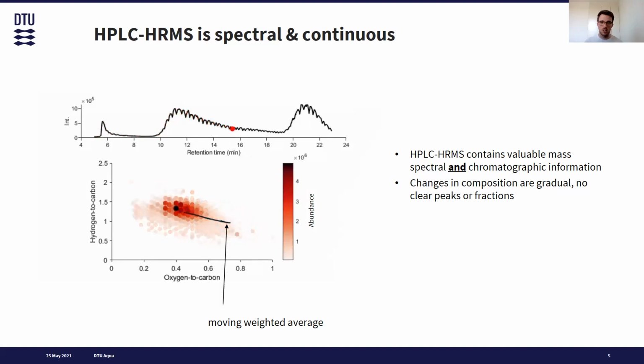So it isn't the case that we have clear-cut fractions that differ completely between the different fractions. We have a lot of things in common and some changes in the composition, but they are very gradual. So this is a relatively complex separation that is very gradual. So a fractionation into, say, 4 fractions maybe is an oversimplification of the picture that's emerging here.